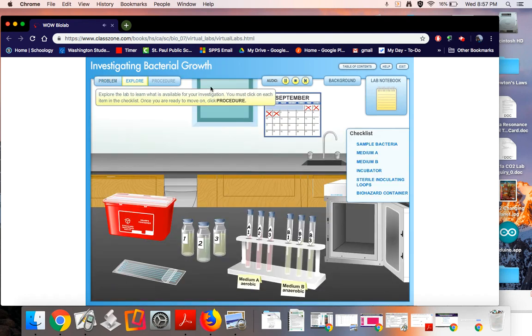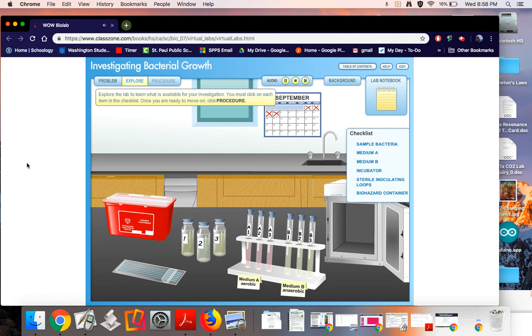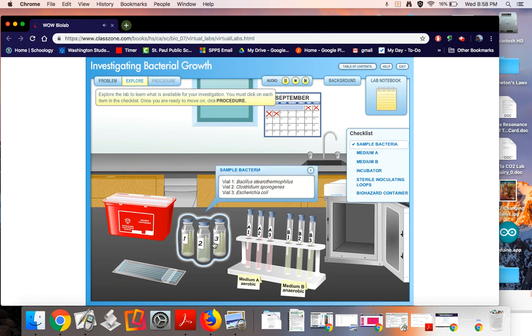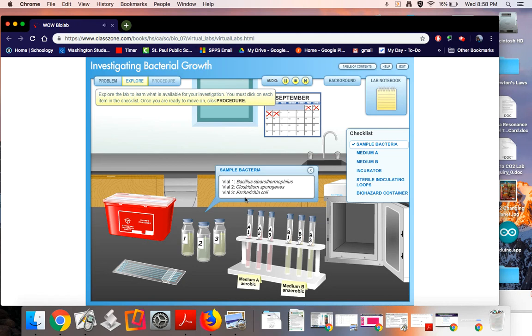Explore the lab to learn what is available for your investigation. You must click on each item in the checklist. Once you are ready to move on, click procedure. Okay, so it looks like we have three different vials here. Sample bacteria vial 1: Bacillus stearothermophilus, vial 2: Clostridium sporogenes, vial 3: Escherichia coli. Okay, so that's where my three bacteria are coming from.